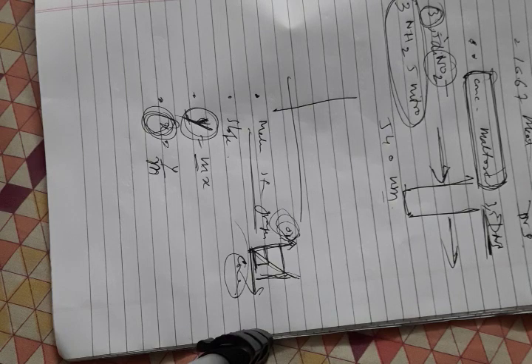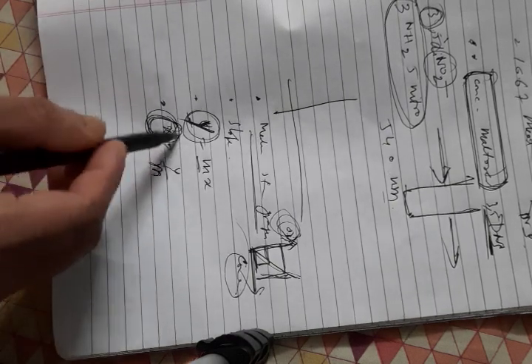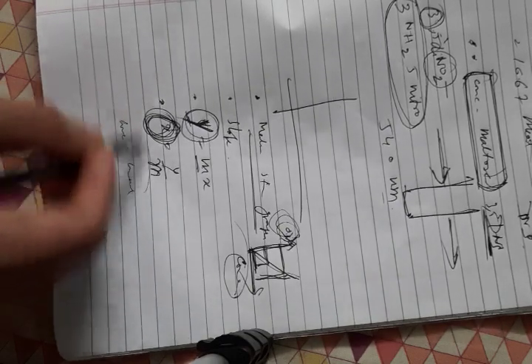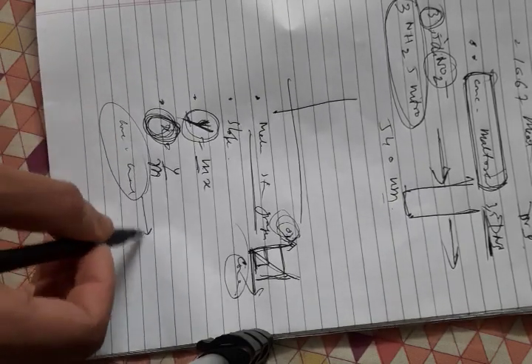Well, that's it. Then since we know the concentration of maltose, we can find out how much maltose is produced by multiplying it with the volume.